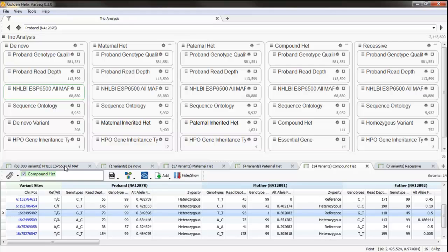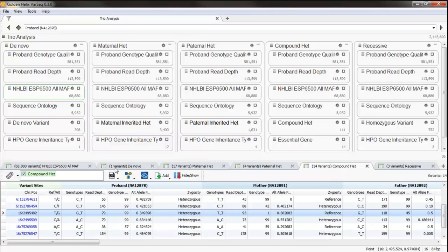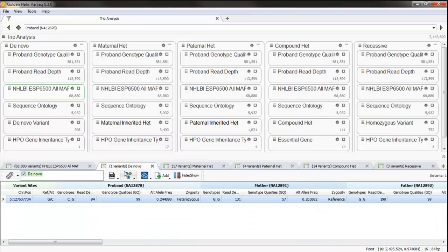So the next thing I wanted to demonstrate is I have these tabs, and if you are doing this process in SVS, to create these different ways of looking at the sample's variants would take a number of independent steps, but you would ultimately get to a similar output. You'd have five spreadsheets, etc. Then you'd export them one by one if you wanted to compile them into a report. Maybe you want to pass this down to another person to look at. Here are my five inheritance models. What do you think, etc.